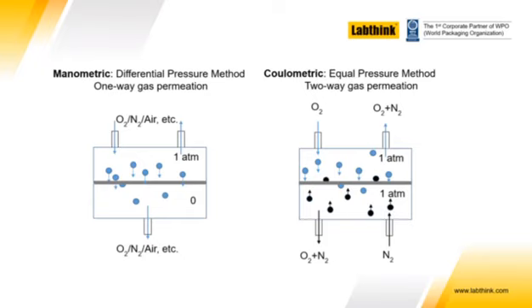And so in this process, you have nitrogen flowing into the cell on the bottom and picking up the oxygen molecules and leaving on the bottom to the left side. And on the top, you have oxygen coming in and oxygen and nitrogen leaving on the top.